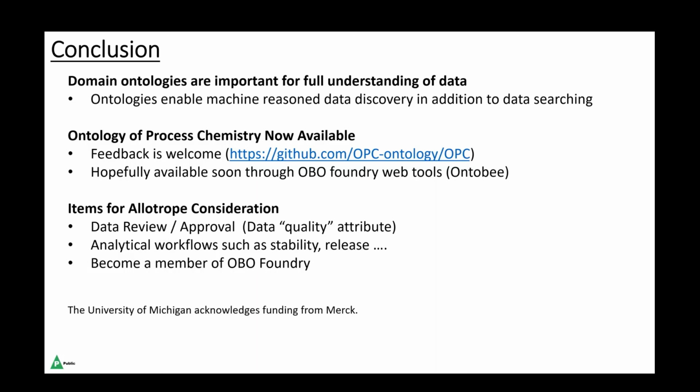And we think it's a good idea for Allotrope to become a member of the OBO Foundry. OBO means Open Biological and Biomedical Ontology Foundry. It's a bigger community, and they have shown very good interest in Allotrope, and definitely there is a chance for collaboration and for joining forces.